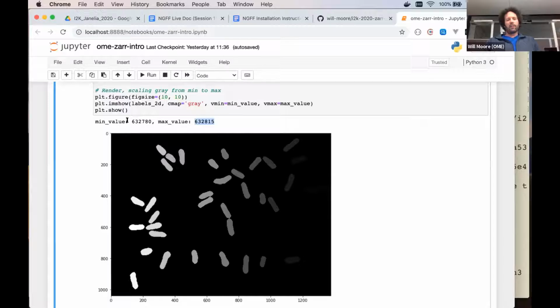This is actually data coming from an instance of OMERO. And in this case, I've chosen to export it using the ID of the mask within OMERO as a unique pixel value. And that's useful if I want to stitch these images together into a high content screen, as I have examples of showing that.